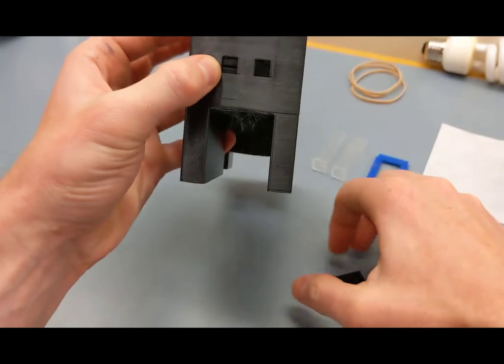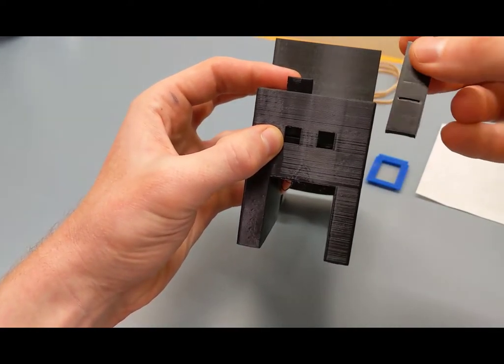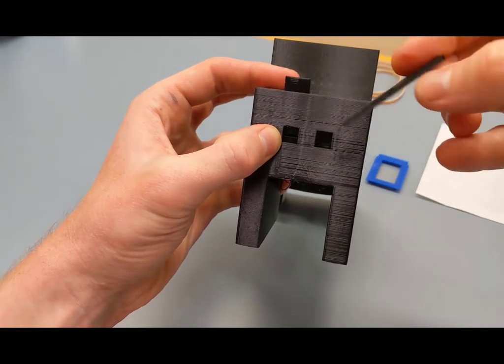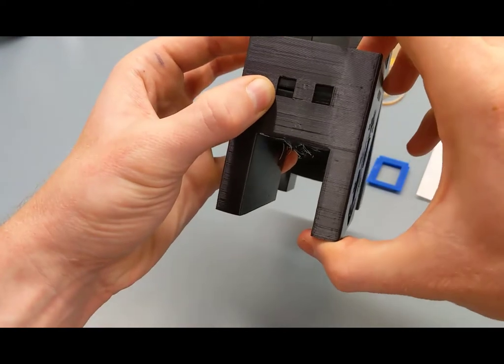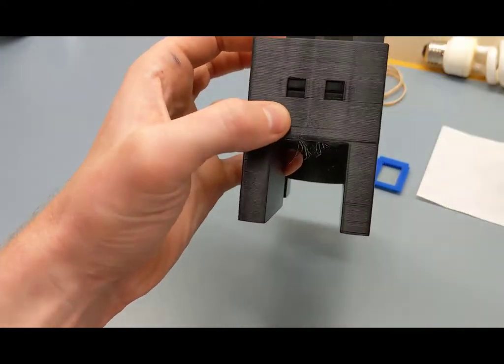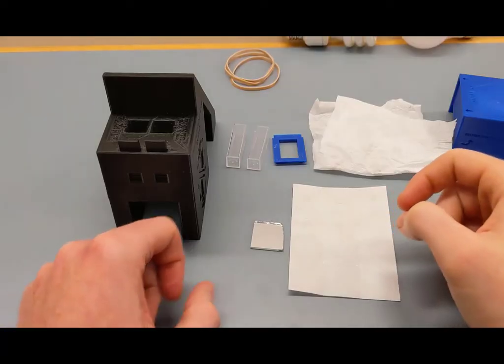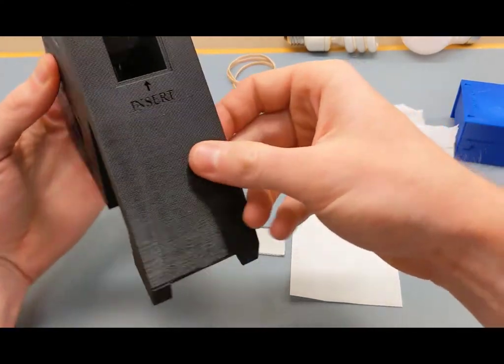We want both slits to be identical, so grab the other one and orient it the same direction — indentation facing backward, slit side down. Keep inserting until you see a matching pair of slits. The second step is to affix the mirror inside the cavity of the base plate.